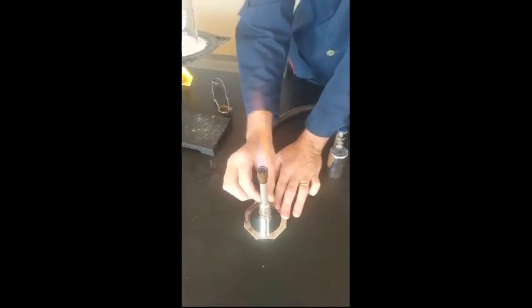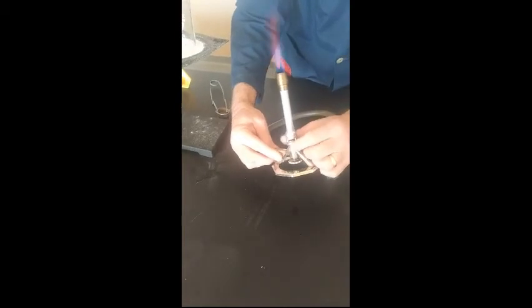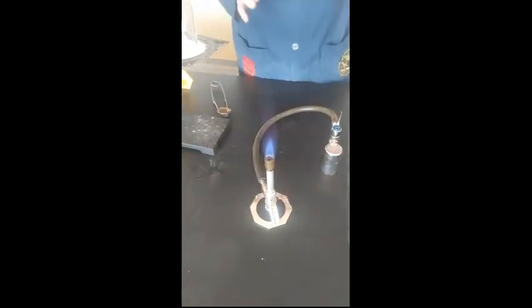All right. So that's a light blue flame there, and that's the coolest flame that you're ever going to be using. Now, you want to keep opening it up, all right? You want to keep opening it up so that it gets even hotter. Now, you want to keep going until the hottest flame is when you cannot see the threads of the screw through the little windows. Now, that is the hottest flame.